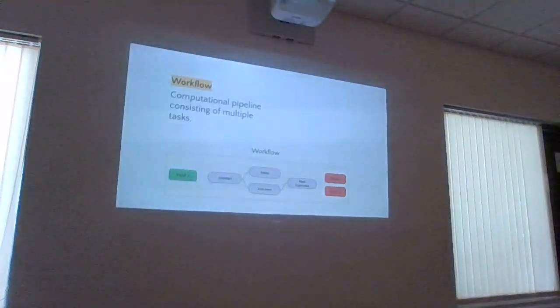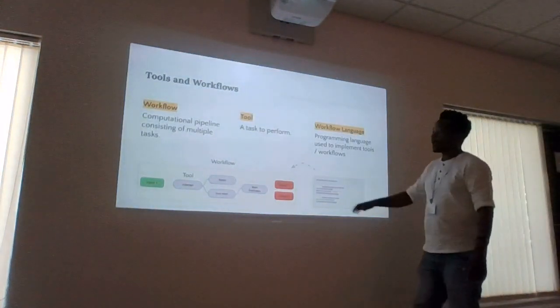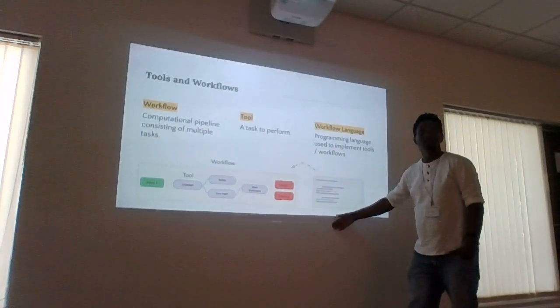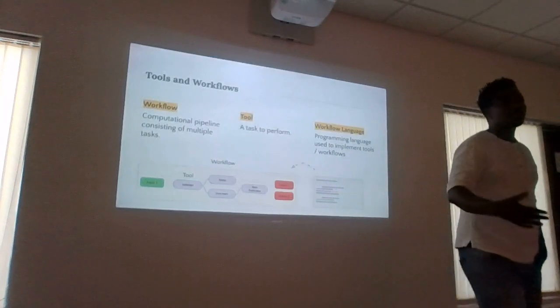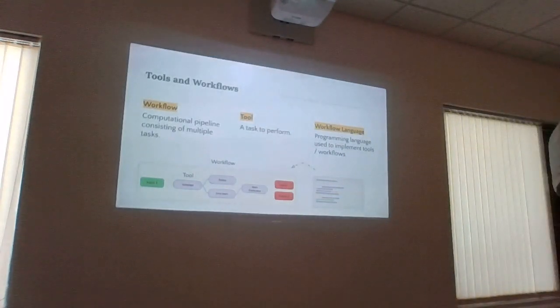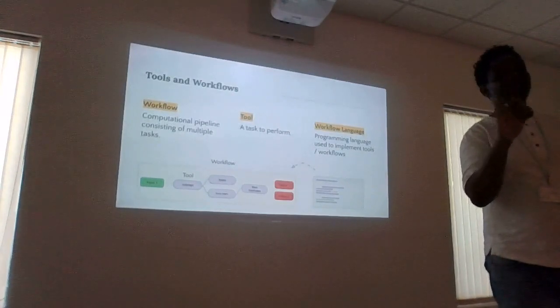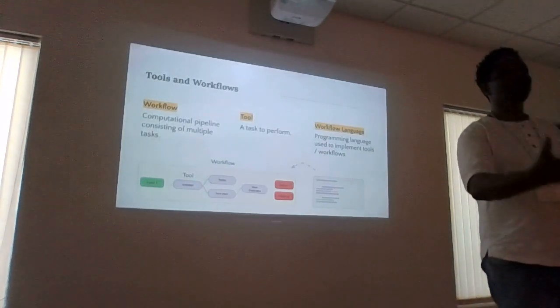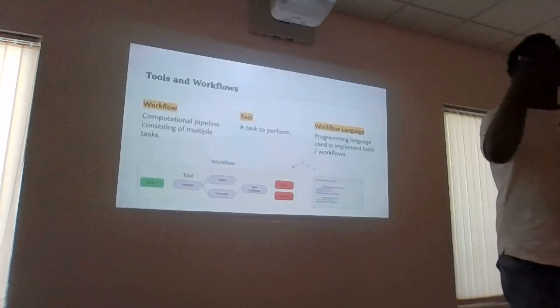So our workflows are actually aimed at generalizing those concepts, and we can implement them in Nextflow or Snakemake, or if you like CWL, which is actually a standard, a common workflow language. I don't know whether we have time, but I might talk a little bit about it, which is simply a way to define a workflow's inputs and does not necessarily tell you what those tools are.